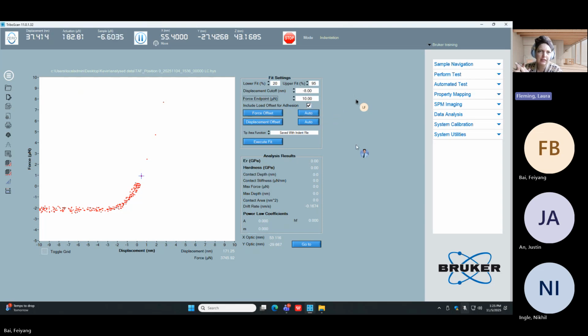And do you understand why I'm picking 10 micronewtons, where that came from? It's where we're chopping here. And I picked that number because it's above our contact threshold, but small enough that it limits the data points so that we don't over-constrain the fit.